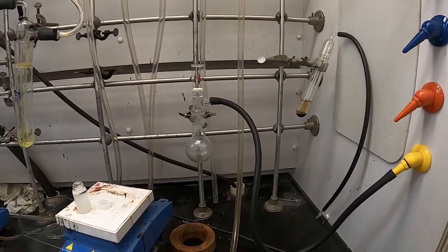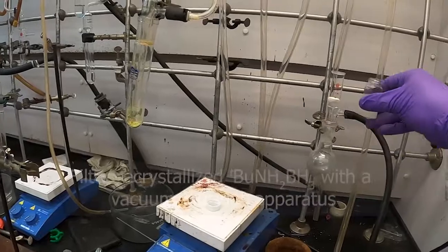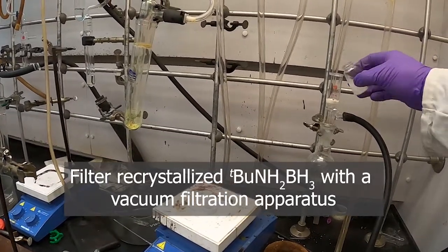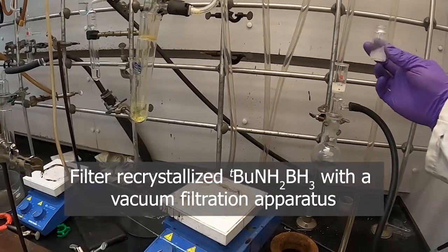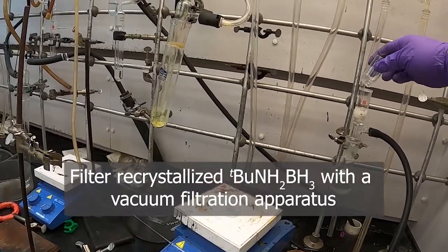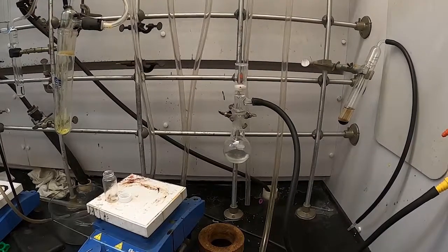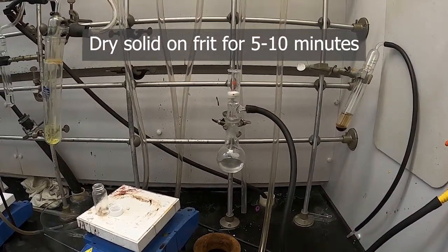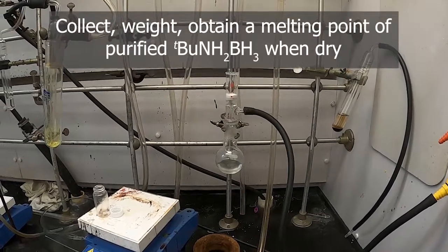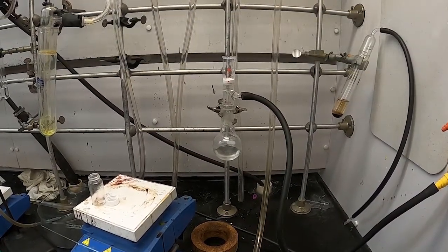Alright, so we're set up for filtration now. So let's pull our vacuum here. We'll take our vial of compound. Try to slosh it off the sides of the vial here. Alright, we'll dry that on the filter for a little while. After you dried it on the filter, you would collect it and weigh it, and you'd also want to get a melting point. But I'll be showing you the decomposition reaction next.